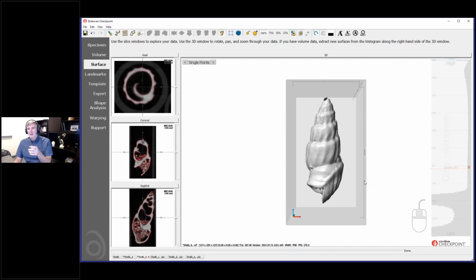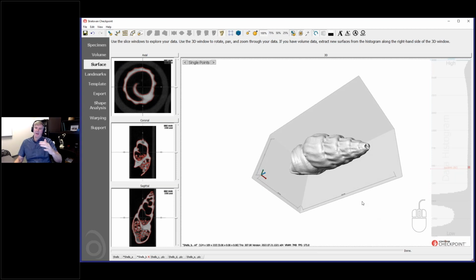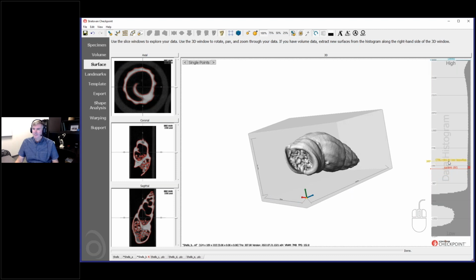And the reason you want to do that is because as you change that ISO value, it's a density value with respect to your volumetric data. So remember the topography example of the height of mountains and that kind of thing. If you're changing that value, you're changing literally the height value within that function. And so as you move the height up and down, that's going to change how those lines kind of circumnavigate that mountain. That makes sense. And so if you go down, it's going to get bigger. If you go up, it's going to get smaller. And that's what's happening here.